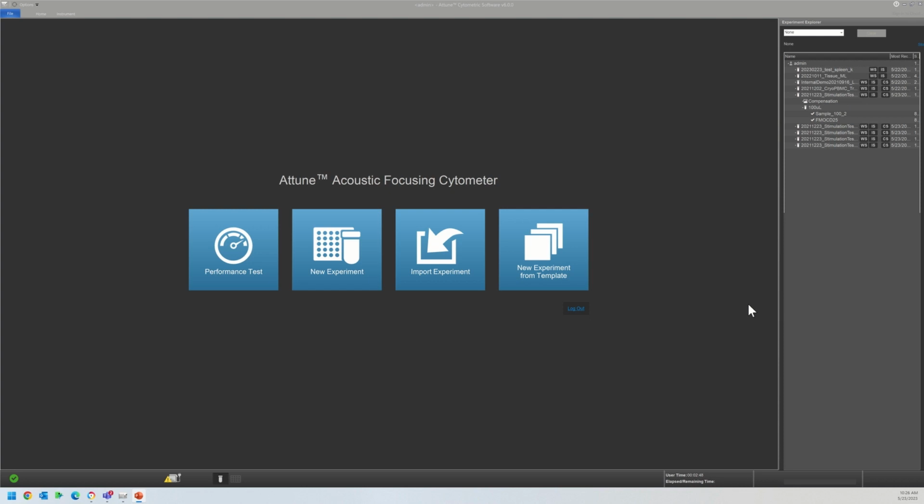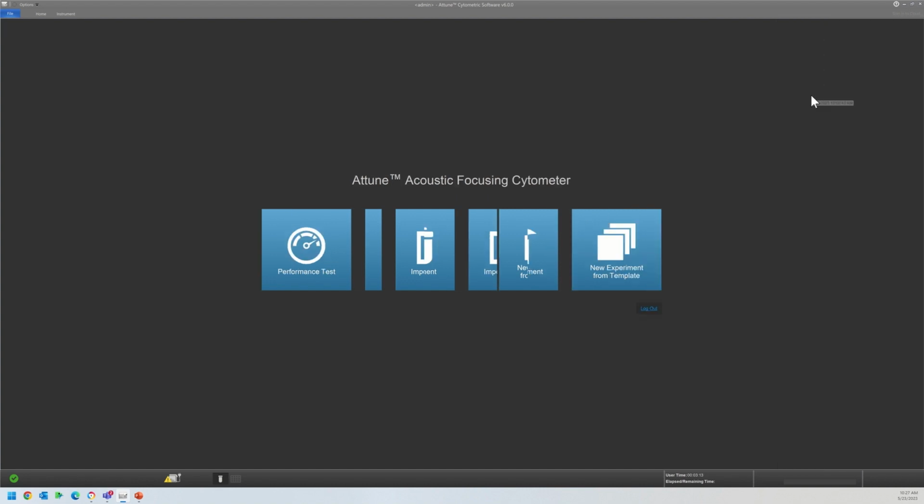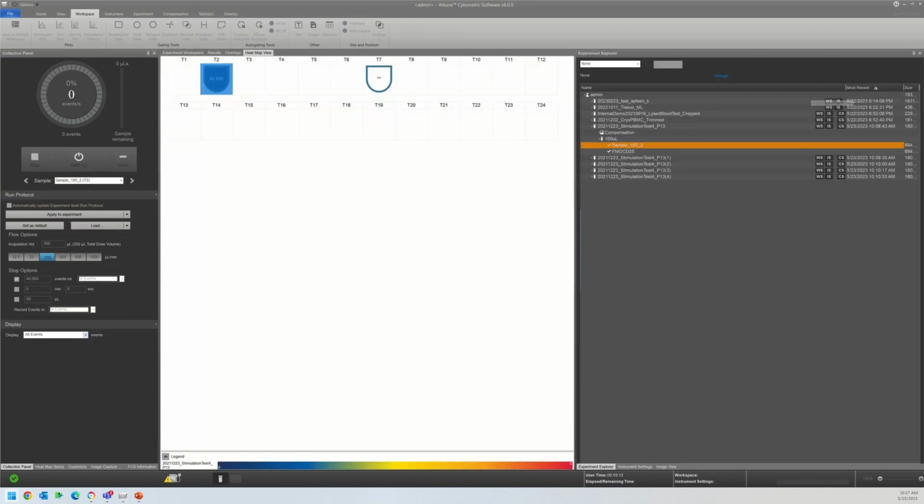So now we're going to begin the workflow to use the automated image analysis parameters. I'm going to start with a file that has been acquired already. You can see the check marks indicate that there's the FCS file present. And the first thing I need to do is click into it. So you see here, if I have not clicked into it yet, my option to process images isn't available. And so to solve that, I just activate the file, which simply means I'm double clicking it, and that allows me now to right click and process images.